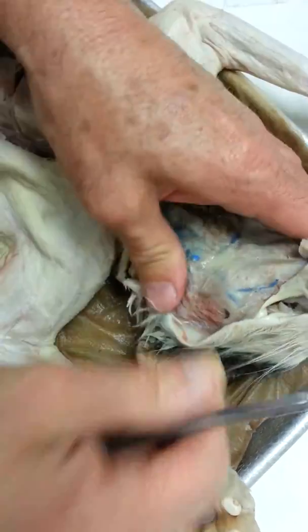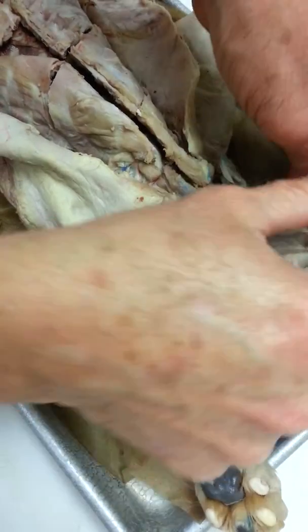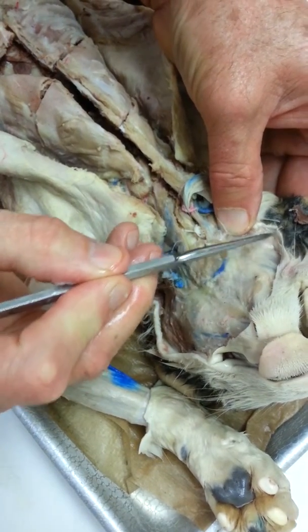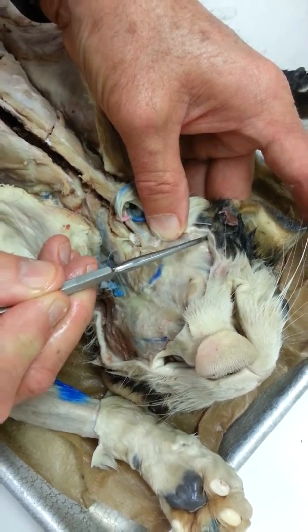this is a better view on this side. All this is masseter muscle. That's the cheek muscle of the cat. And then the gland, and I've got a good one too. This little white mass right here is the parotid gland. That's one of the salivary glands. So I'll ask about the parotid gland here.